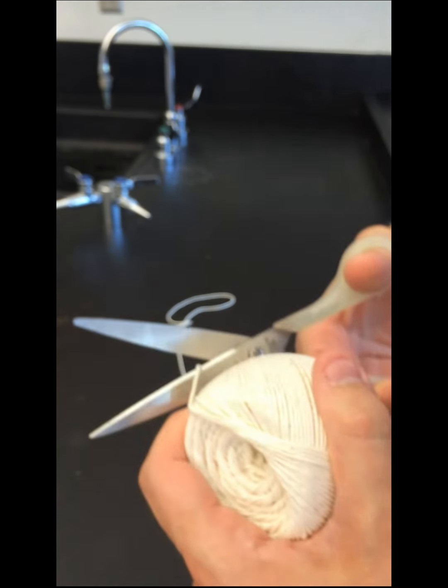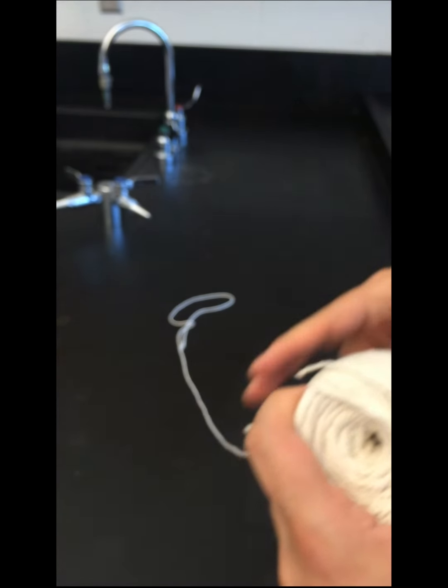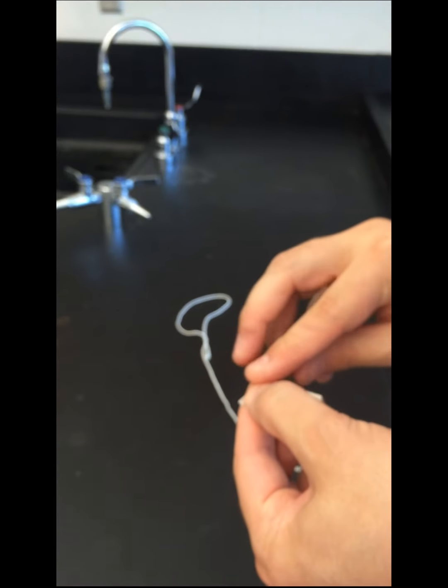We'll need to cut a piece of string in order to tie the magnesium down. This will prevent the magnesium from floating away later on in the experiment.